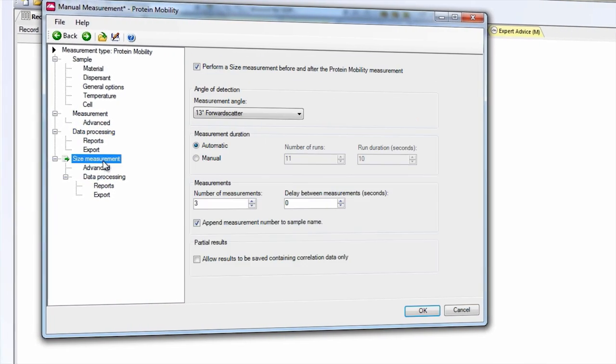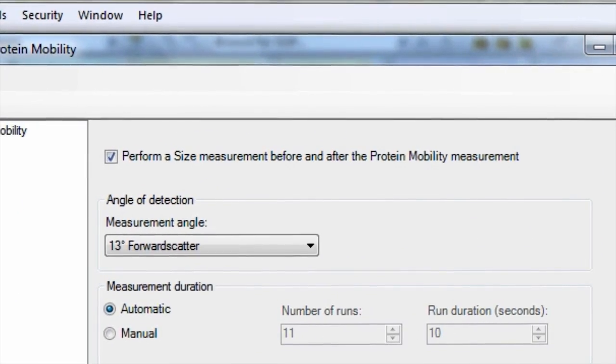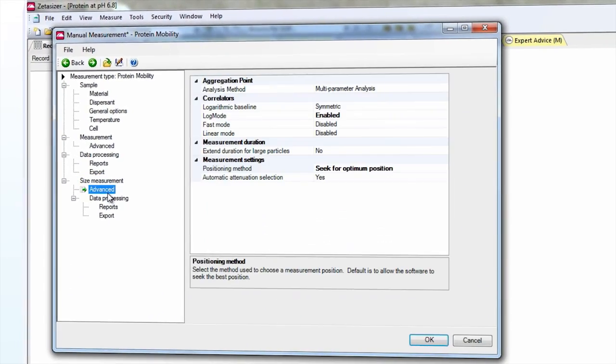Size measurements are performed before and after the Mobility measurement to assess the sample and subsequently the measurement quality.